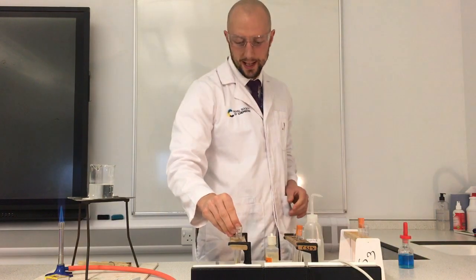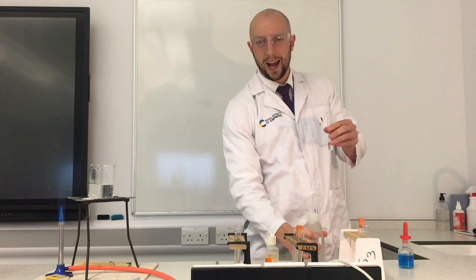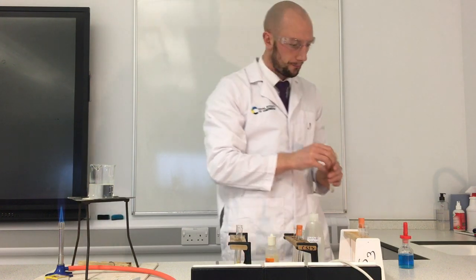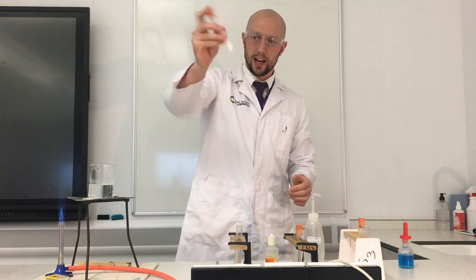Let's have a look at our next test. Our next test is to see whether or not there's any fat in the oil. So I'm going to add some water. I'm going to add some ethanol. Oh, and straight away I think you can maybe see what's happening. I'm going to get my bung. Here's my bung. Shaky, shaky, shake.